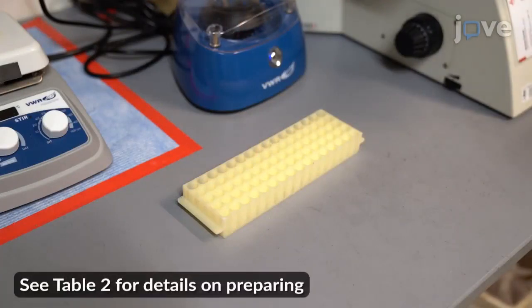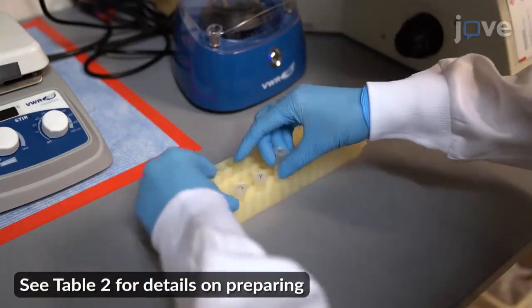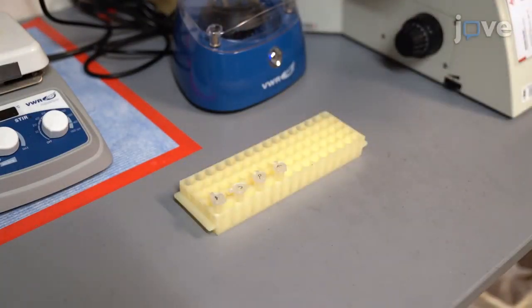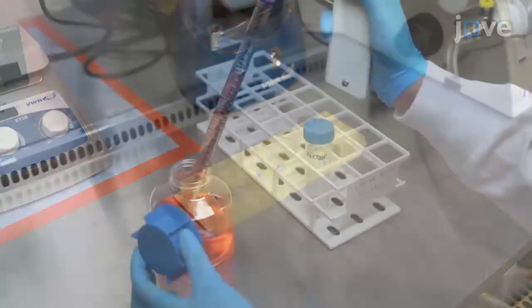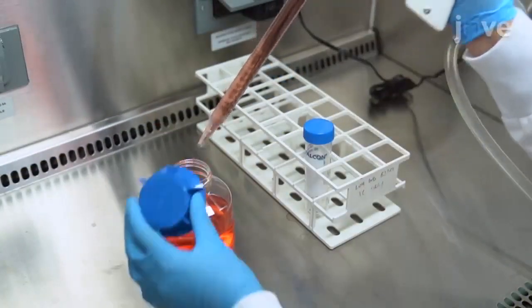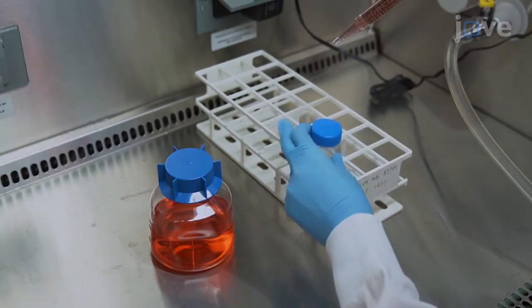To prepare the differentiation medium, first thaw the frozen small molecules and or growth factors at room temperature. Aliquot out the required amount of base medium and add the specified small molecules and growth factors to them.